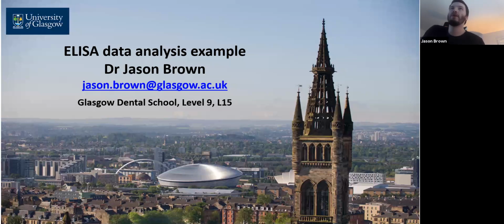So hi everyone, this is Dr. Brown, and this is a session where I'm going to talk through how to analyze ELISA data. This will follow on from the inflammatory biomarkers lecture that I have uploaded to Moodle, and this is going to be on how to handle, process, and present ELISA data.